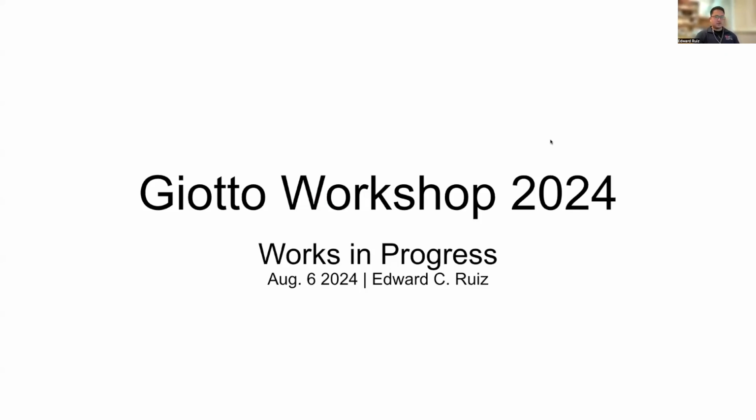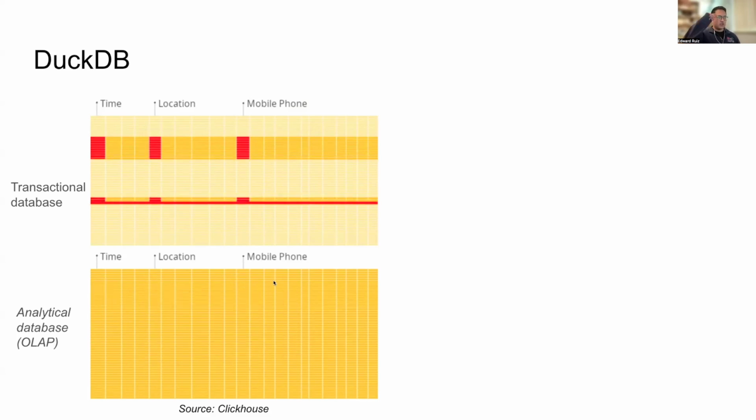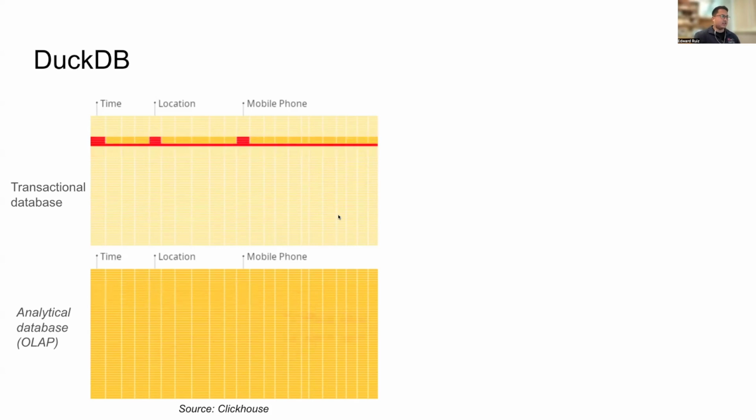Thanks, Ruben. So yeah, I'm just going to briefly go through some slides on what I've been working on recently to try and get at some of these problems that Ruben had mentioned regarding the scalability of these operations. And this has been an ongoing project of mine with George for the past year and a half or so. And basically, we've landed on using a database called DuckDB, which you guys may have heard about before. It's very popular right now in the analytics field.